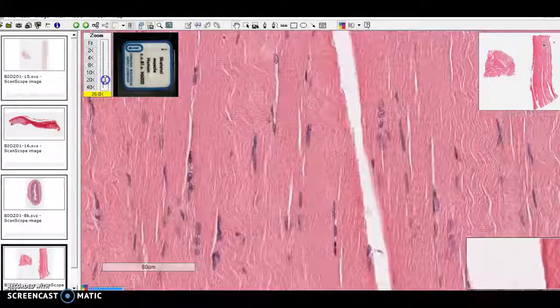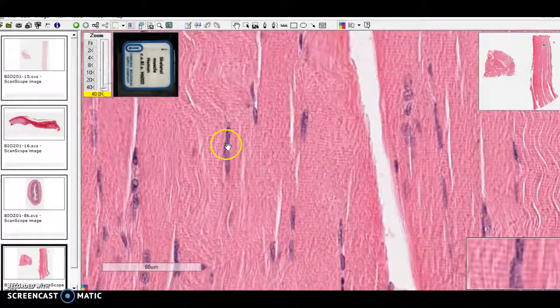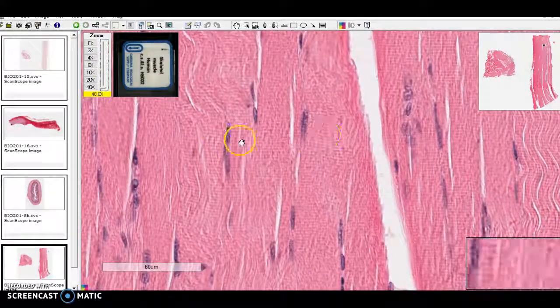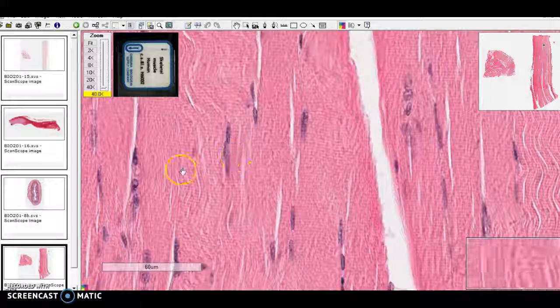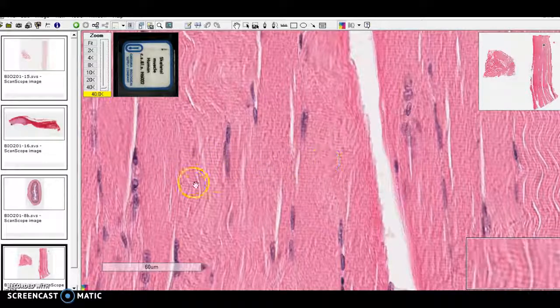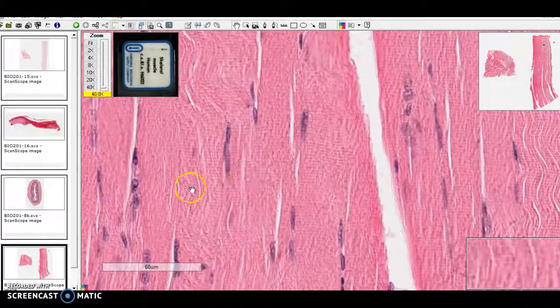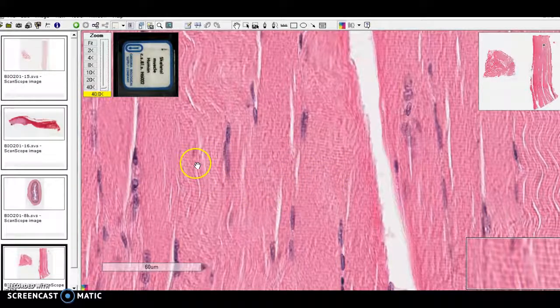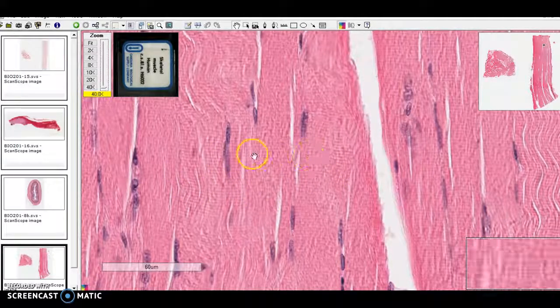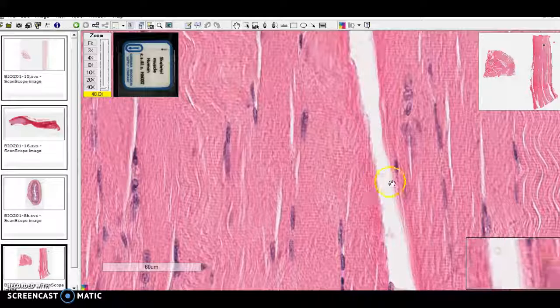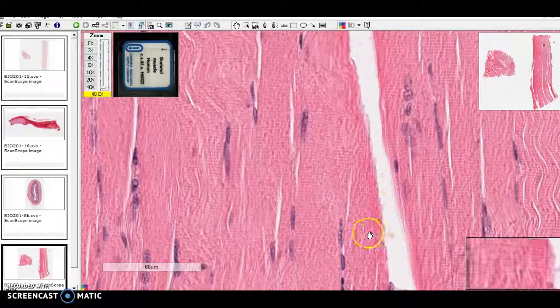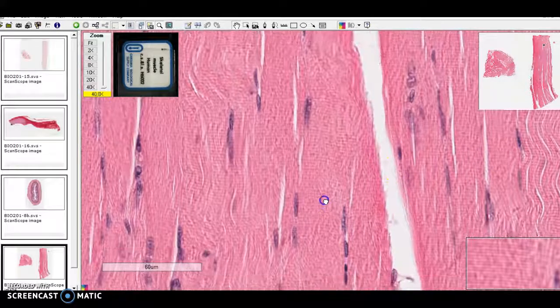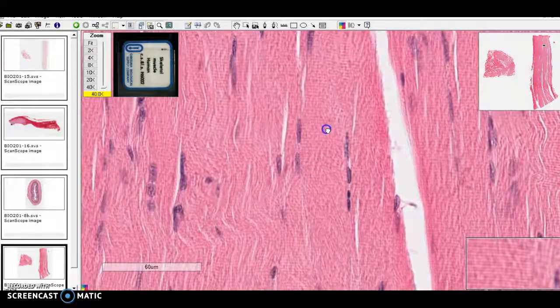here we go. We can see these bands, this kind of light pattern, diffraction pattern, running this way, crossways through this tissue. And those are the striations.